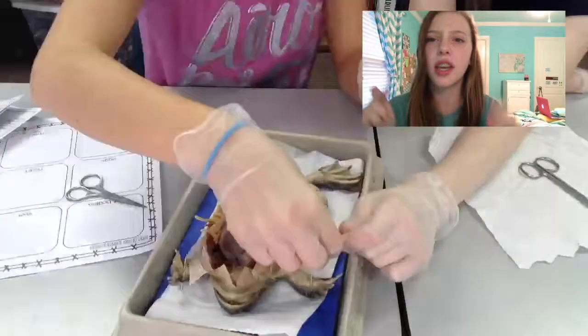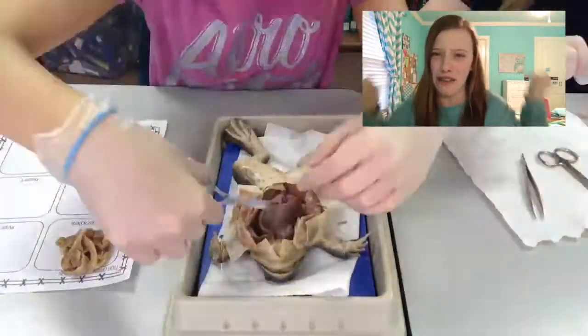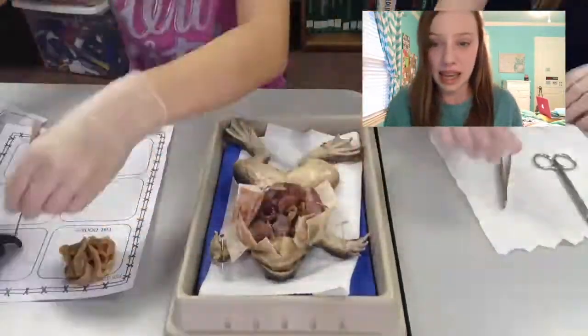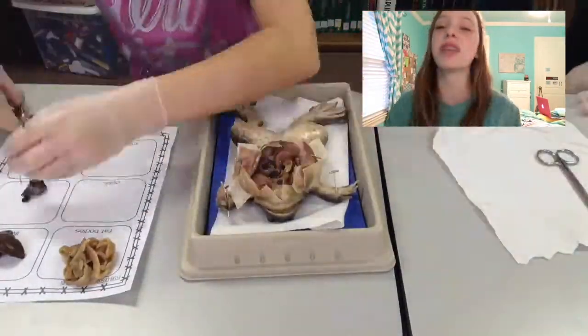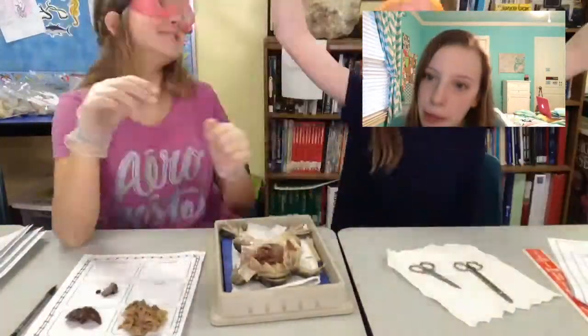Do y'all see that right now? Do you see that? We are taking out the parts of our frog. Thank you to my partner Jessie for helping me. Yes, so we had to take out the internal parts of our frog and put them on a sheet of paper.